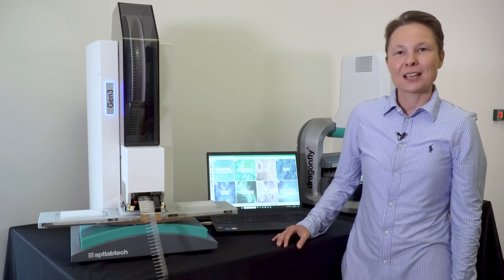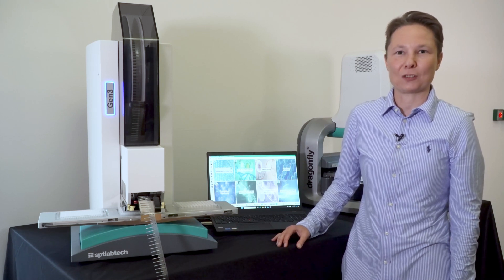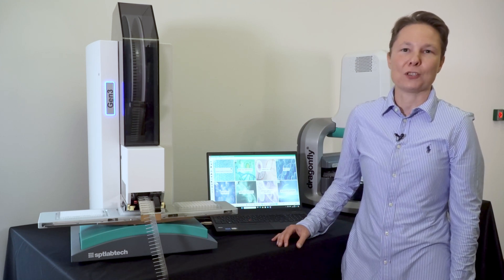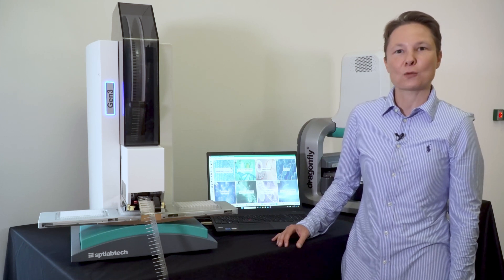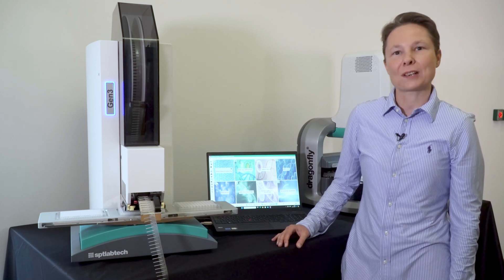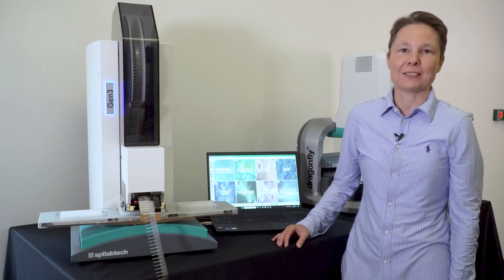Mosquito Gen3 is a high-speed true positive displacement pipetor that works with a variety of different plates in 96 and 384 format. Its proven capability to miniaturize over 40 molecular biology methods, combined with its small footprint, makes it an ideal solution for scientists looking not only to reduce the cost of reagents and consumables, but also to maximize their laboratory space — space that has become extremely tight these days.